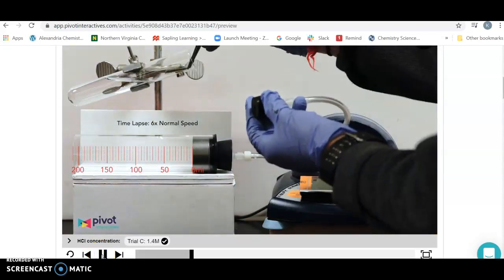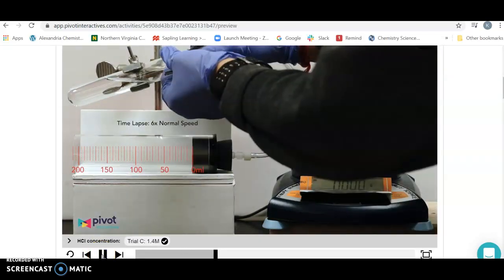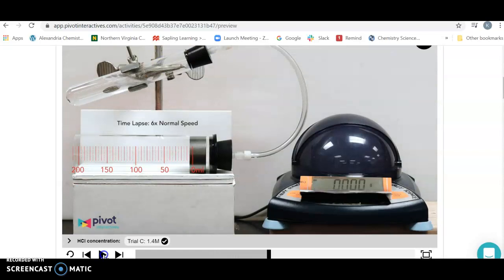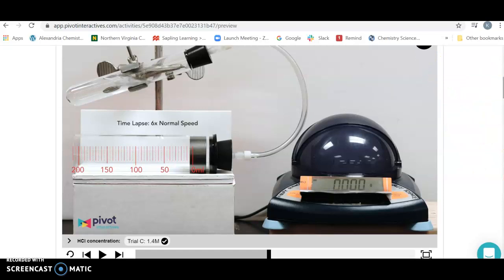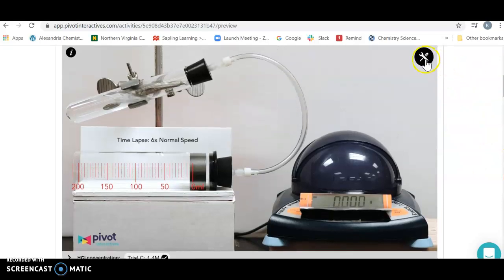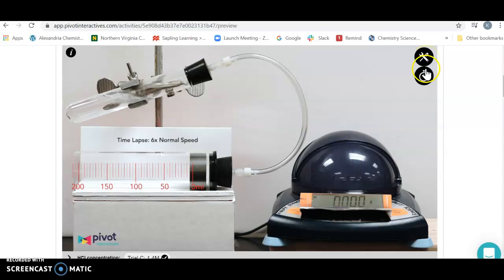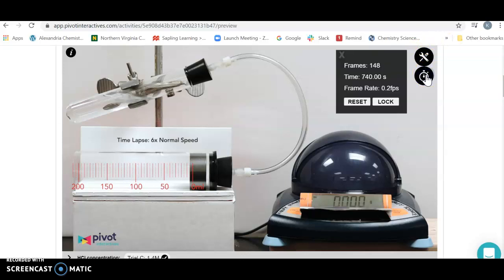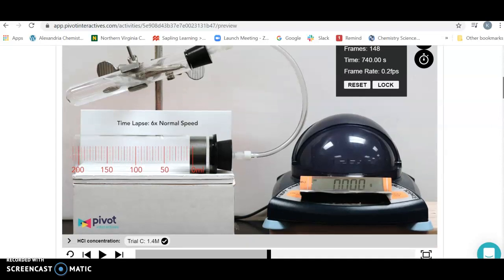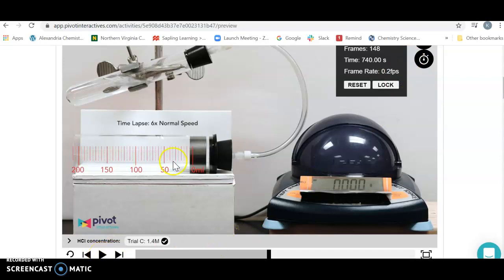Press play. They're going to put a paste of magnesium into the HCl and something is going to start to happen. To measure the time we have to have our tools out - the stopwatch. Click on your tools, bring out your stopwatch, and make sure that we can look at the amount of time it takes.